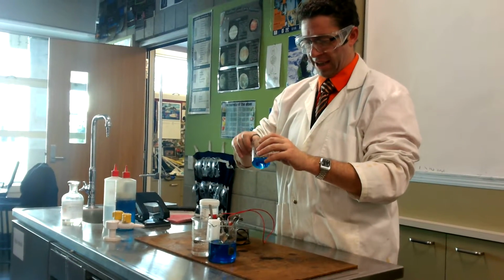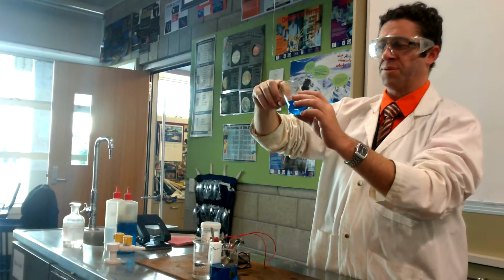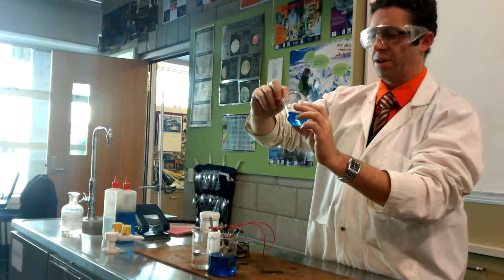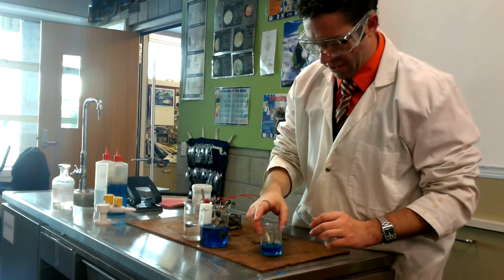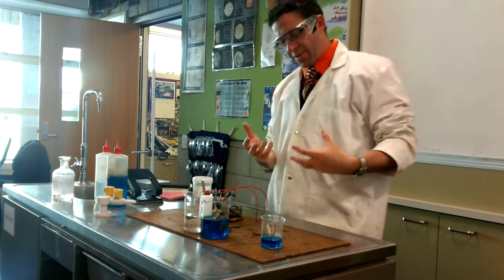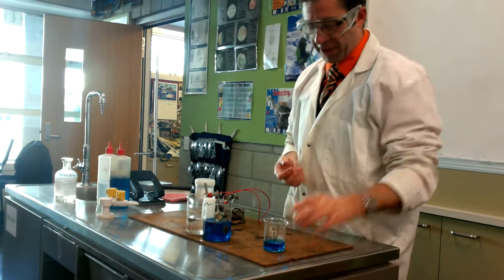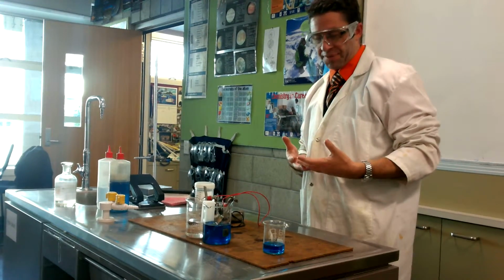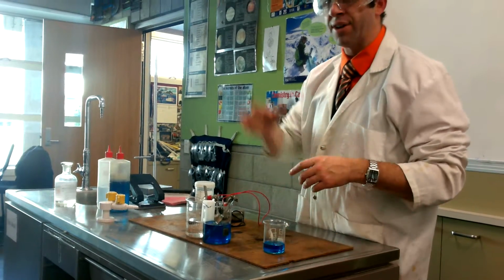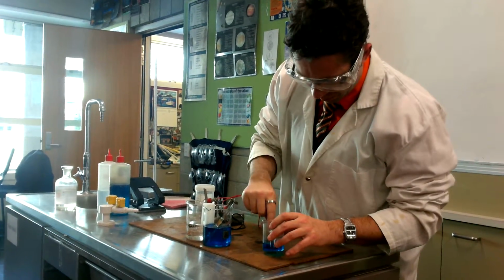And if I put the zinc in there for a small amount of time, here's where I hope this will happen fast enough for the video. It's starting to. If I leave it in there, then what I notice is that there's a bit of a colour change to the zinc. This copper sulfate is so concentrated that I won't see its colour change. But if I had enough zinc there, or if this was dilute enough, its colour would start to fade as well.